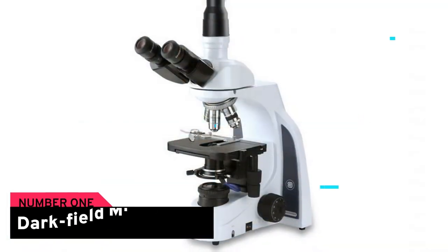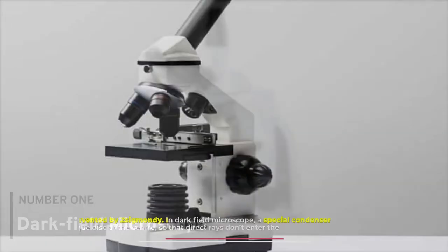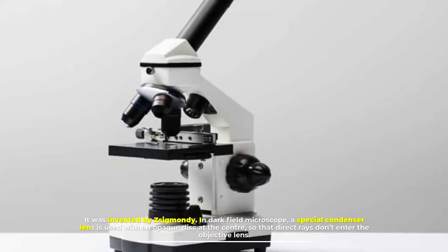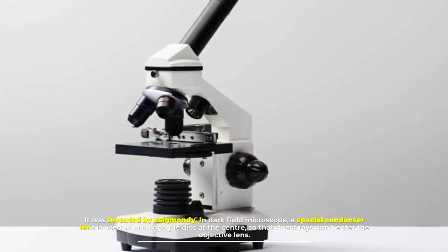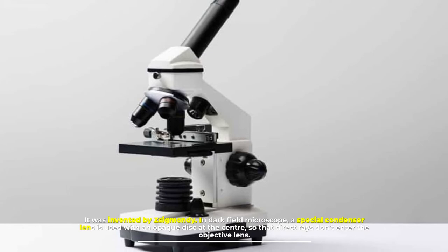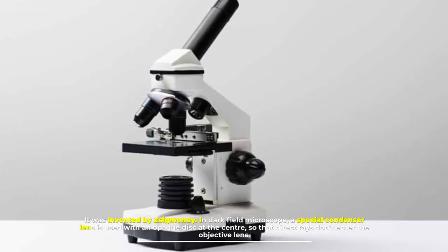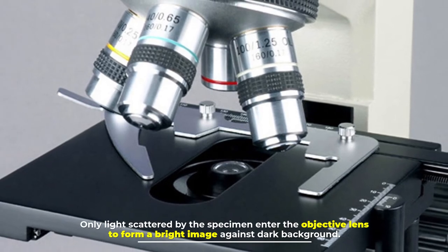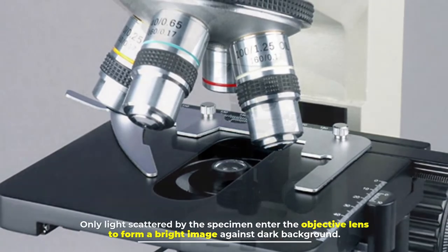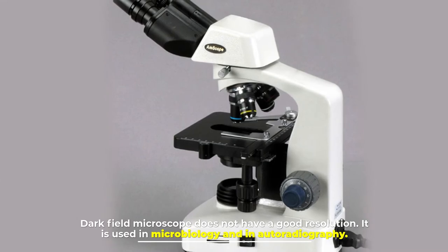Number one: dark field microscope. It was invented by Zsigmondy. In dark field microscope, a special condenser lens is used with an opaque disc at the center so that direct rays don't enter the objective lens. Only light scattered by the specimen enters the objective lens to form a bright image against dark background.